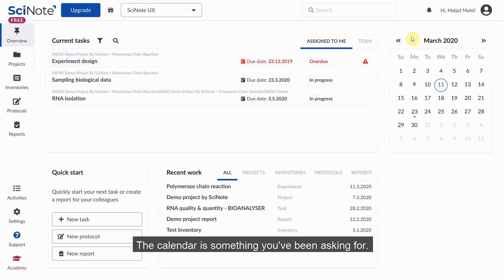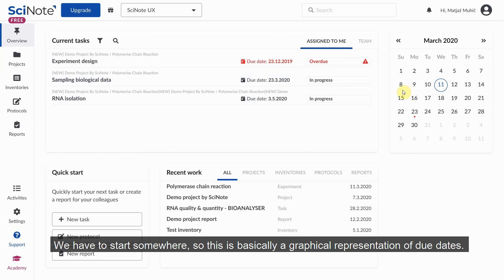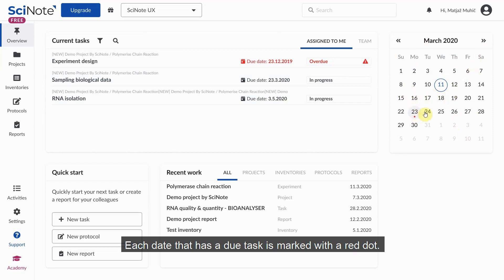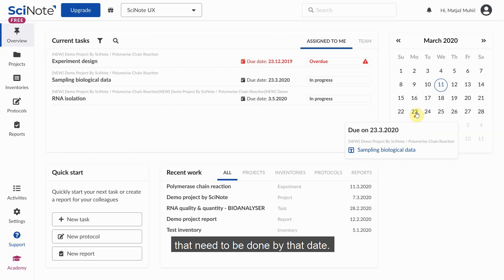The calendar is something you've been asking for, and here's the first step to our bigger calendar integration. We have to start somewhere, so this is basically a graphical representation of due dates. Each day that has a due task is marked with a red dot. Upon clicking that day, a flyout reveals a list of all the tasks that need to be done by that date.